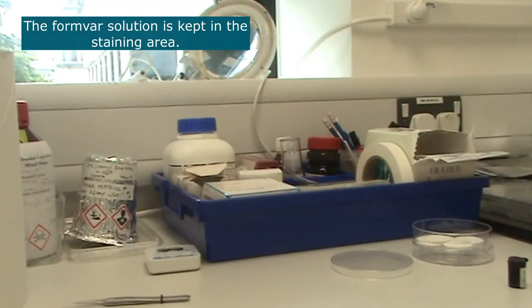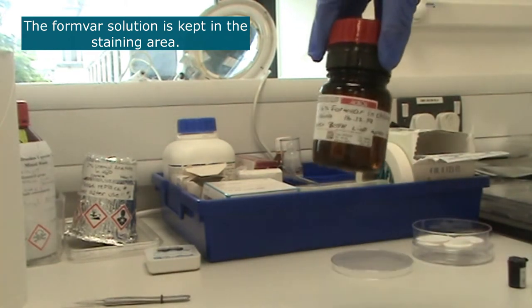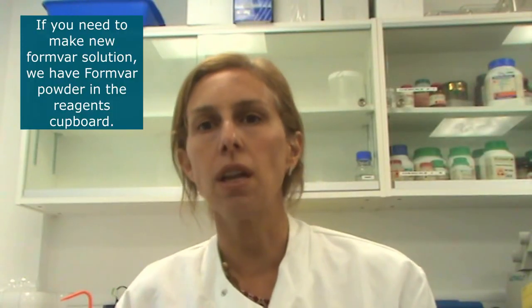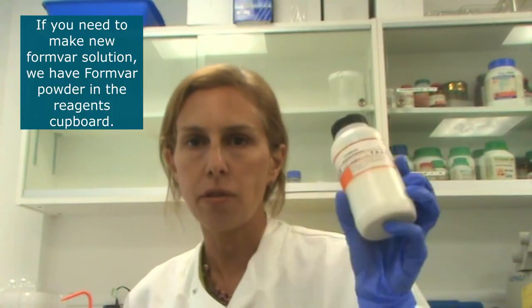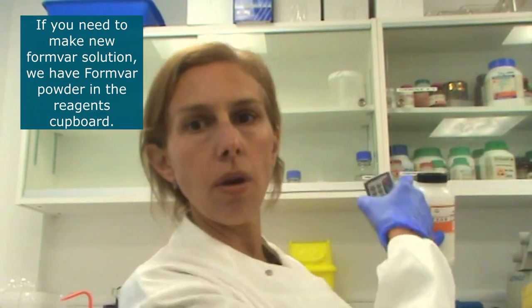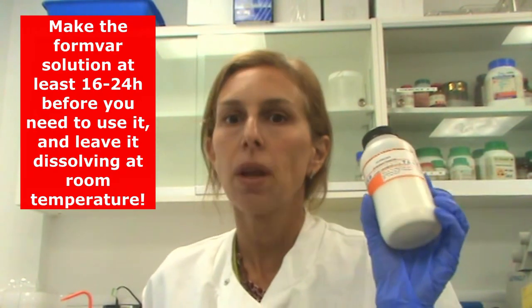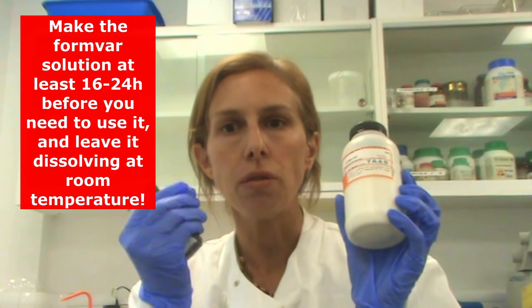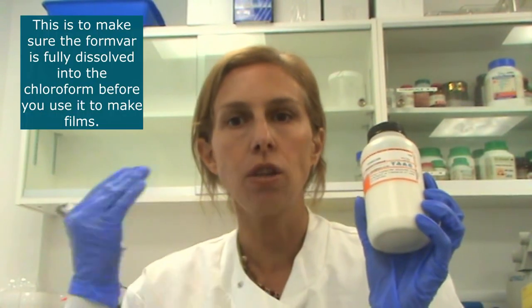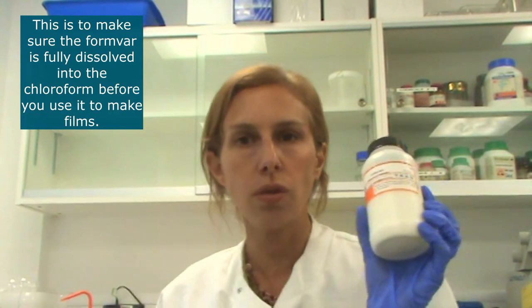The formvar solution stays here in the staining area. If the formvar solution has run out and you need to make new formvar from powder, we've got the powder there in the chemical cupboard. But you have to make it the day before, because the formvar granules take a while to dissolve, so they need to be dissolving overnight at room temperature for you to be able to use the formvar to make films.